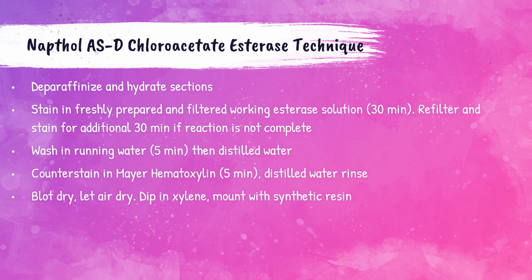To perform the naphthol ASD chloroacetate esterase technique, tissues should be deparaffinized and hydrated. Stain in freshly prepared and filtered working esterase solution for 30 minutes. After 30 minutes, if the reaction is not completed, the solution should be refiltered and stained again for 30 minutes more. The slides should then be washed in running water for 5 minutes and then washed again in distilled water. Then, Mayer hematoxylin should be used as a counterstain for 5 minutes.